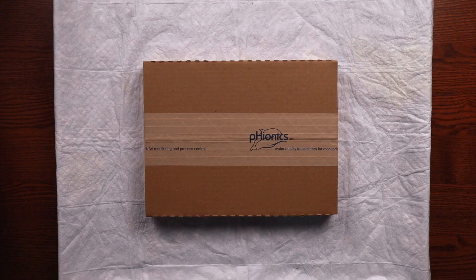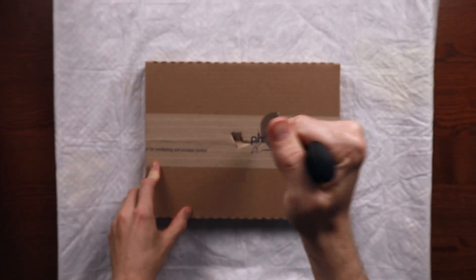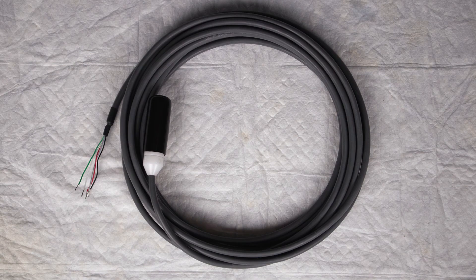When opening these smaller boxes, avoid cutting deep with your scissors or knife to prevent damage to these components. Once you've opened the boxes and removed the contents, you should find a cable of the length you ordered with the connector covered in a protective boot. It's always a good idea to check along the length of the cable to verify there are no signs of damage.